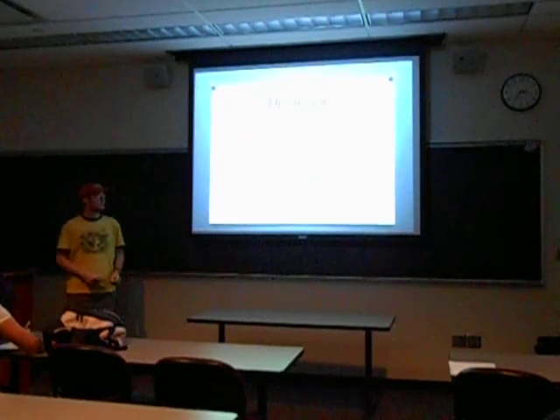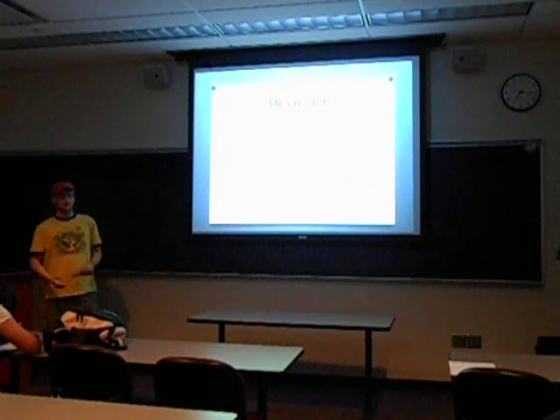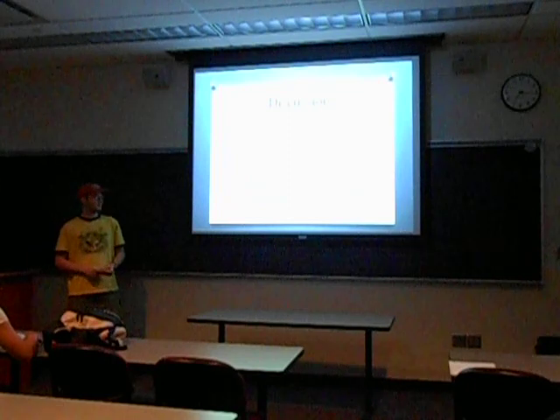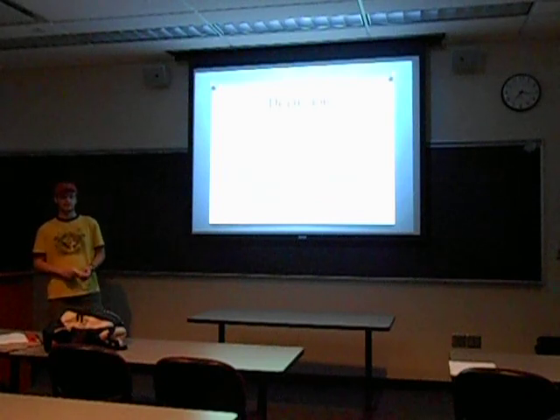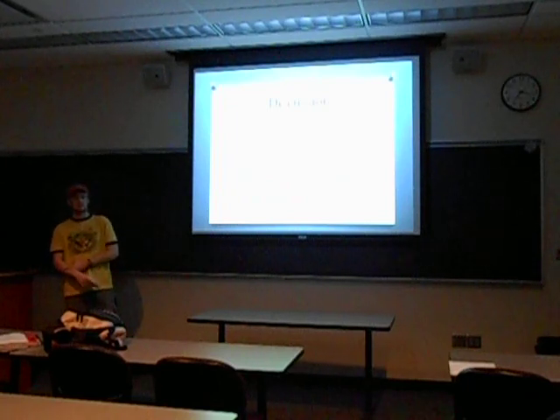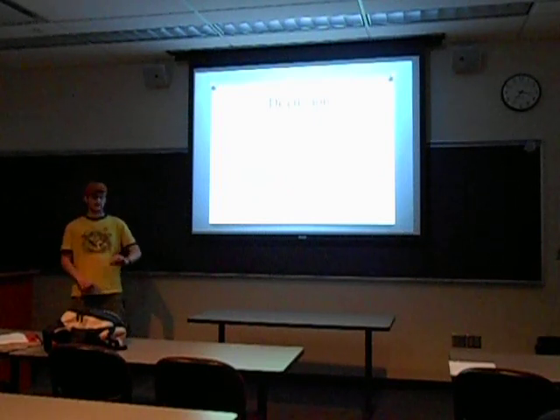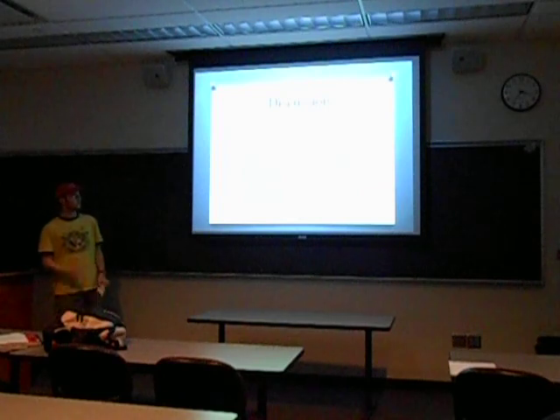So some of the discussion questions here. The first one was talking about source of error. So if you had HCl in your KHP originally when you're standardizing the NaOH, they wanted to know what would happen. We said that the concentration of the NaOH would increase because there'd be less moles of KHP to react with the NaOH during the titration, but you'd still calculate the same number of moles being used because you didn't know the HCl was there. But the volume of NaOH that you actually used would decrease, so it's a fraction.